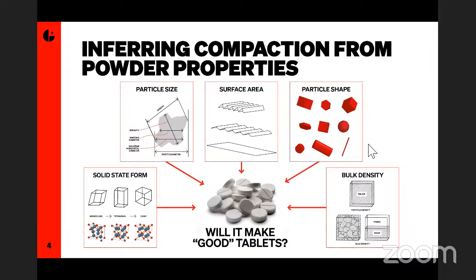And this is the area I worked in previous roles as a materials scientist. I worked on tablet formulations, and when I moved to measuring compaction directly, I was able to give my colleagues much more definite answers on whether the changes they were considering, for example, may cause the tablets to become weaker. And this is instead of saying it probably will or probably won't. So this makes a big difference.